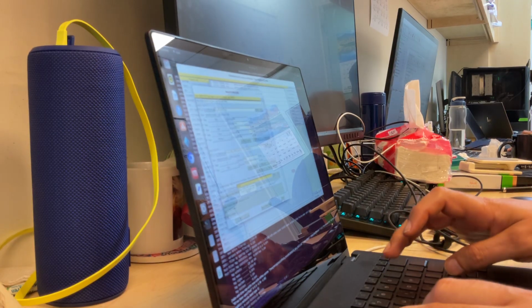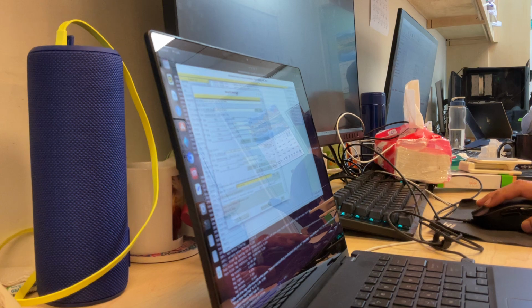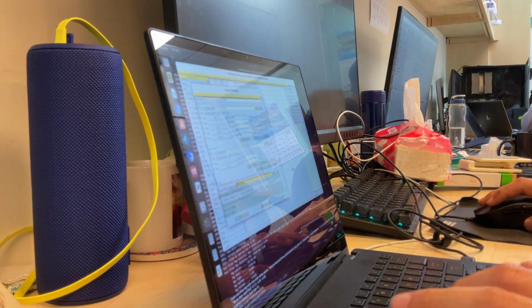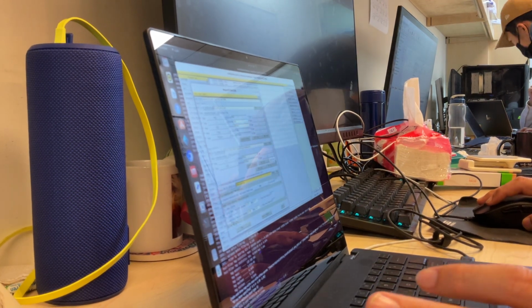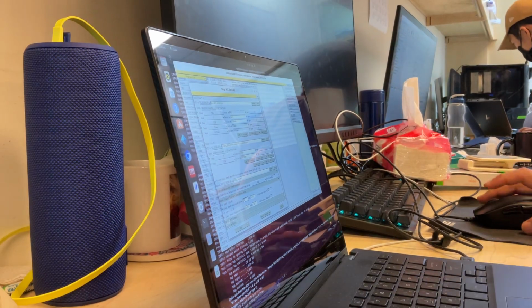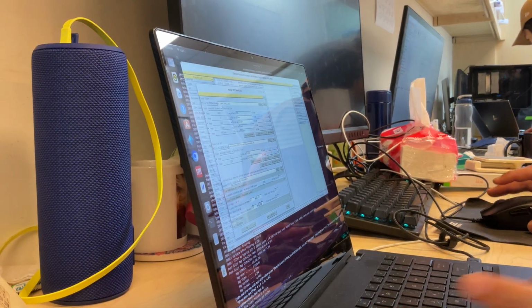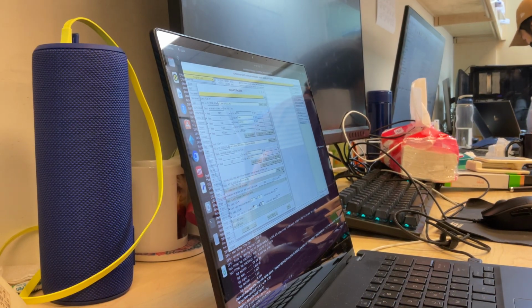So, and now we're gonna call it 180 picoseconds CAD.mtz. CAD because the program is called CAD. Now we're going to provide the resolution limits, and here we're going to set it to 35. Here we're also going to set it to 35. And what is the maximum resolution of the 180? Yeah.